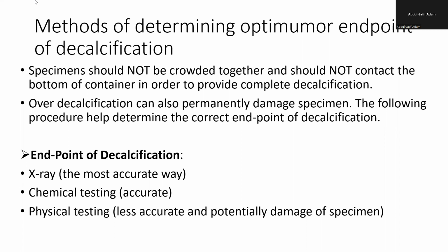Okay, so the physical method, as I was talking about, you can use your fingers to test whether there is calcium, but the physical method is not accurate because your hand cannot go as deep. Okay, and depending on the sensitivity of the person, one may not feel the calcium in it as somebody else will feel.